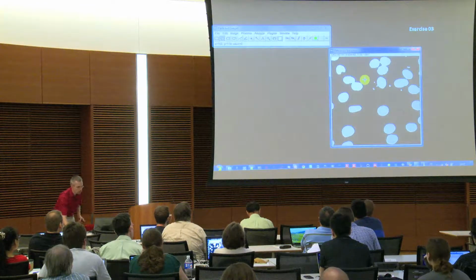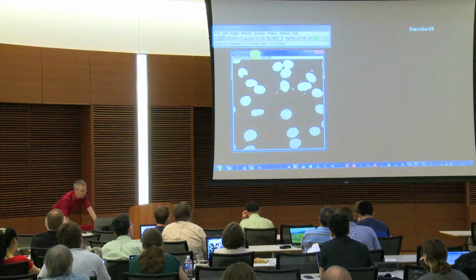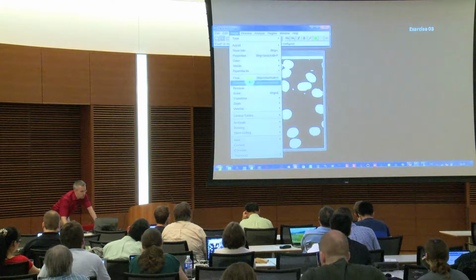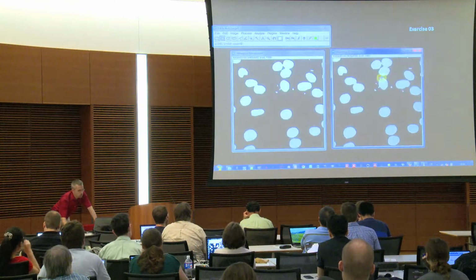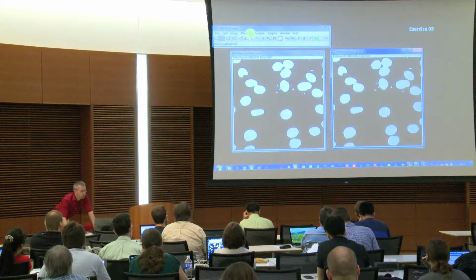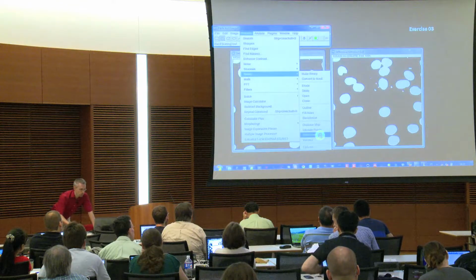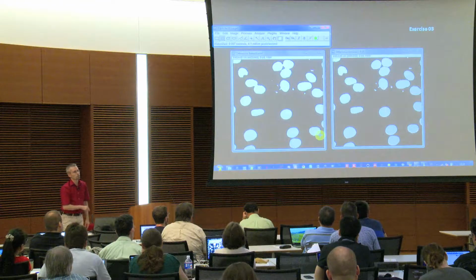And this is now done, and hopefully better make a duplication of that, because it might go wrong. So go to image, duplicate. Sorry, it was a little bit quick. Image, duplicate. And accept that and continue first with that one. Since we are working with binary images, now we go to process, binary, and the function we want to use is watershed. And when you apply that, then you see in comparison, actually, now we get exactly what we've seen beforehand. We get the separation.